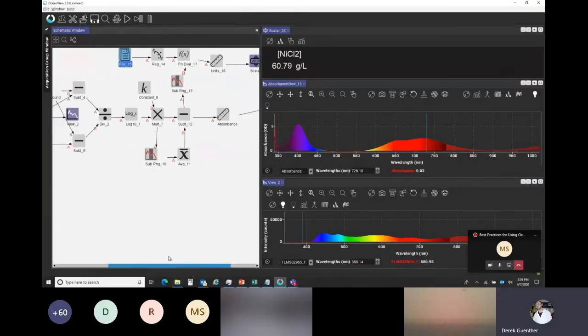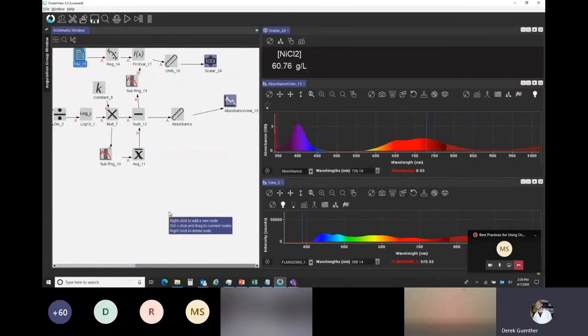So you can build these very quickly. And we did this in like 15 minutes. This would have been, you know, a bunch of money probably from a custom engineering firm if you had presented the same thing. But we want to give you the tools to do this stuff very easily yourself.